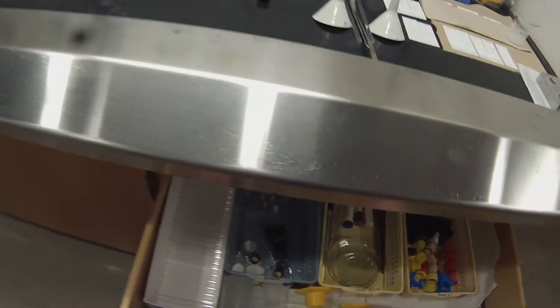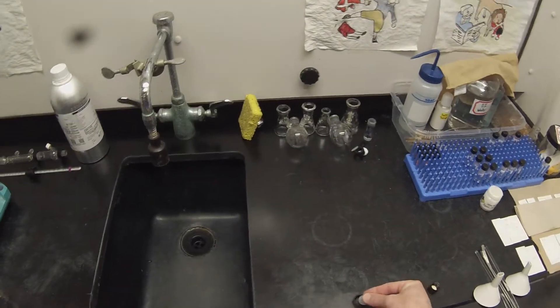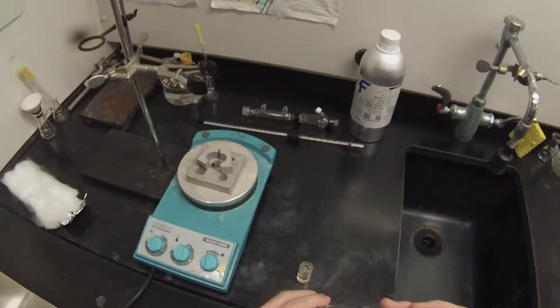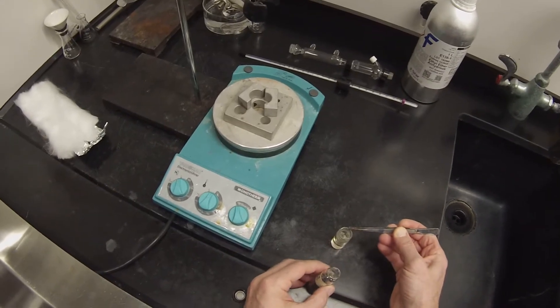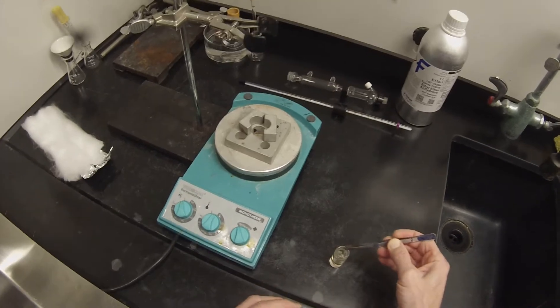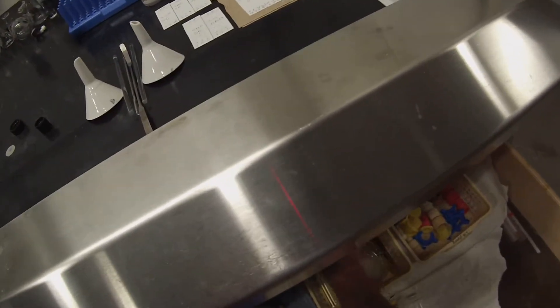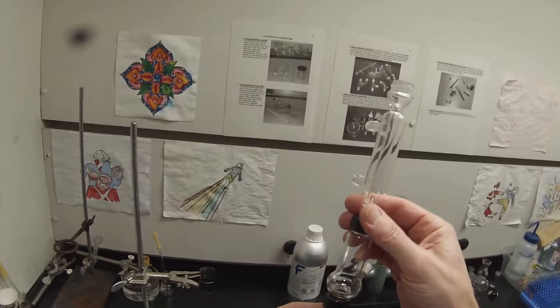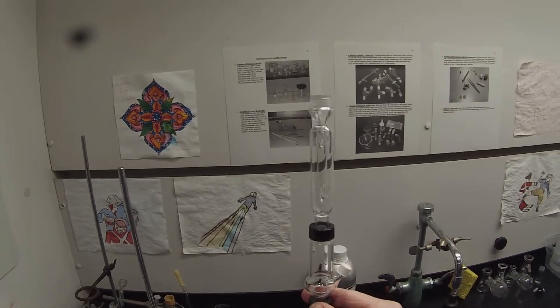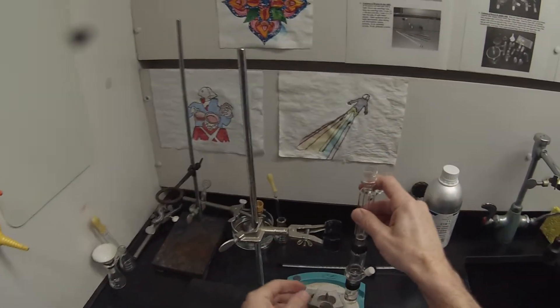That should be warmed up enough, close to room temperature, that I can put some boiling stones in there without introducing moisture. We'll take the cap off. Nice fruity smelling ester. I'm going to add two boiling stones, and then we will attach this to our assembly.